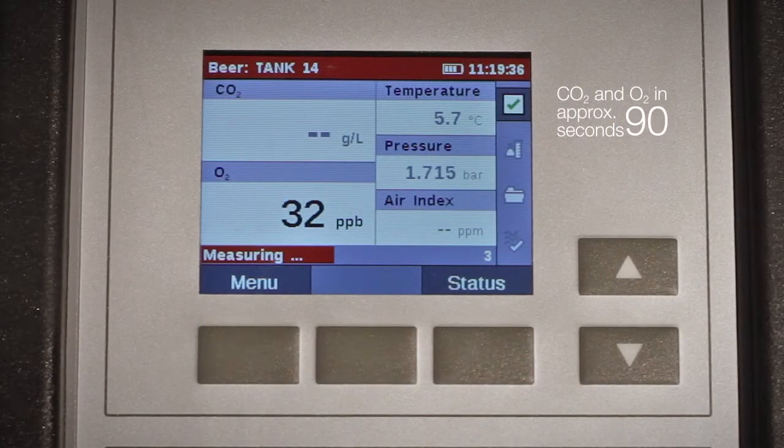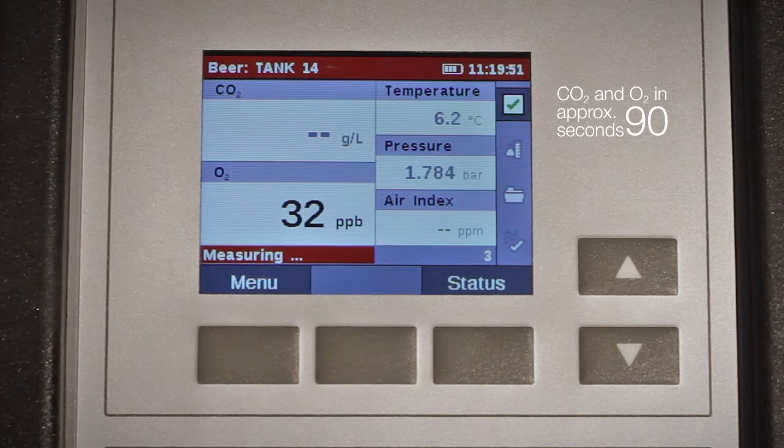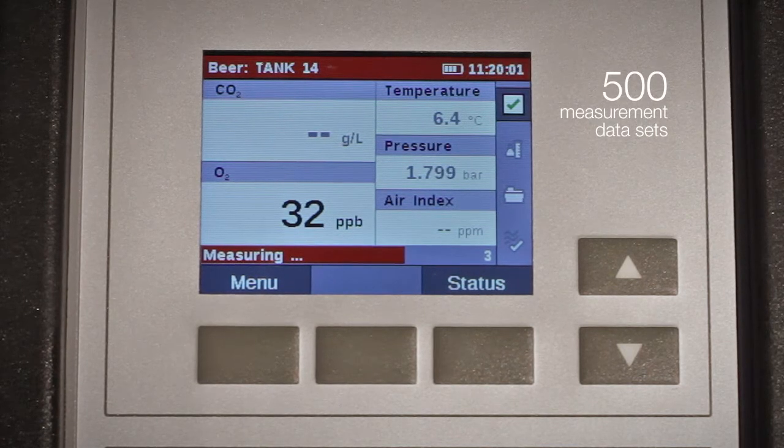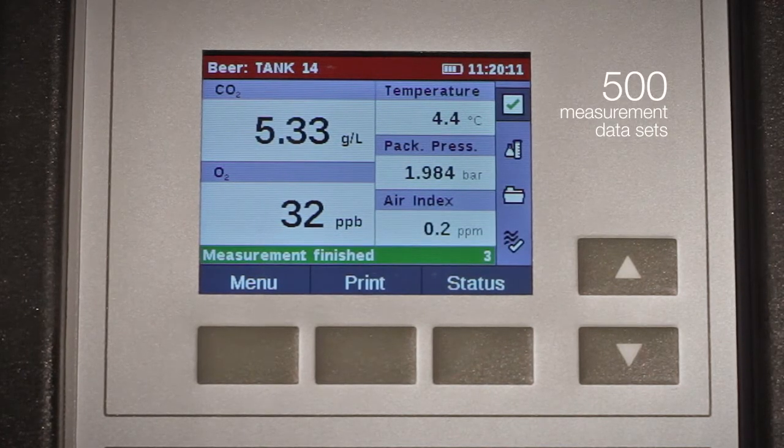All in all, the CO2 and O2 results are ready in about 90 seconds and stored in a data memory of 500 measurement data sets.